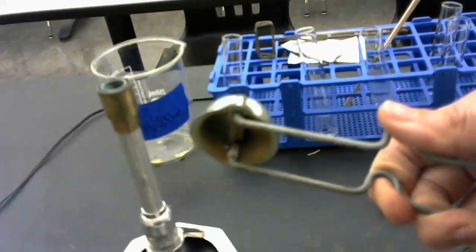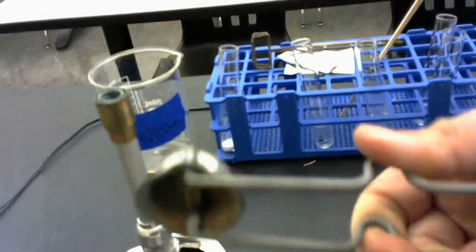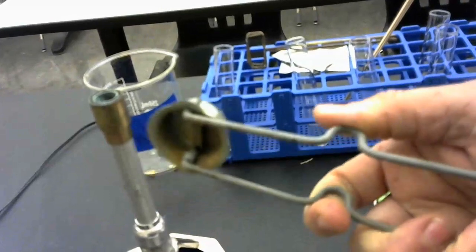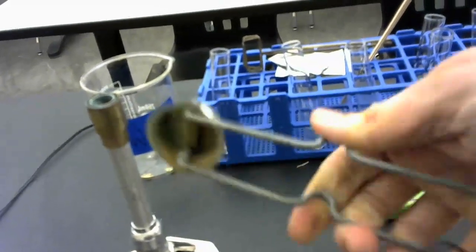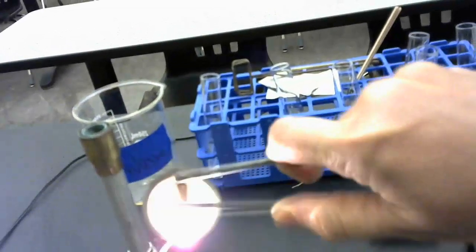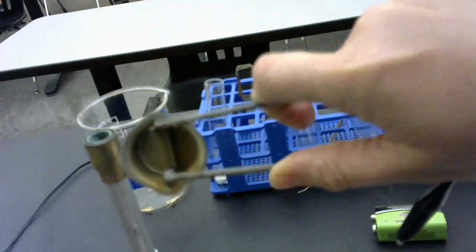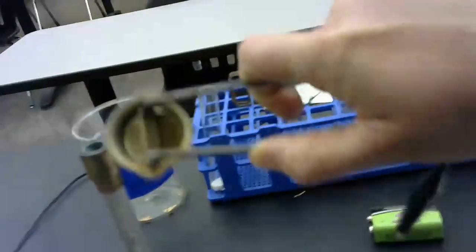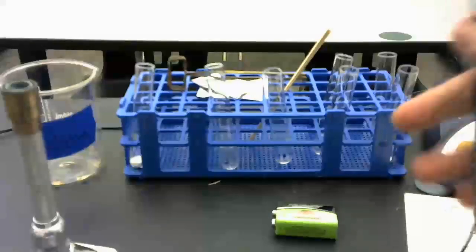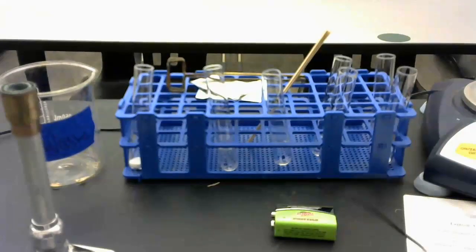I want to make sure that I get enough friction to make a flame, like a tiny spark almost. Okay, I'm not getting enough of a spark, so I want to make sure I create enough friction. So I want to push down with one and pull back with another to get that flint to go. Okay, I'm going to put this back over here and go ahead and get that started.